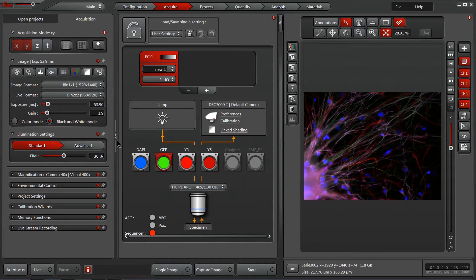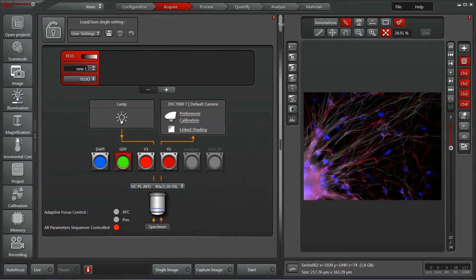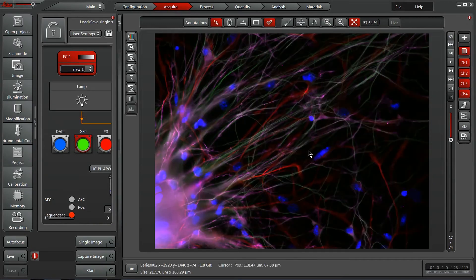Each panel can be compressed by clicking in between the two panels, as I'm doing here. This can give you a lot of real estate for your image, where you could focus easily or see clearly if you captured the important event that you would hope to capture.